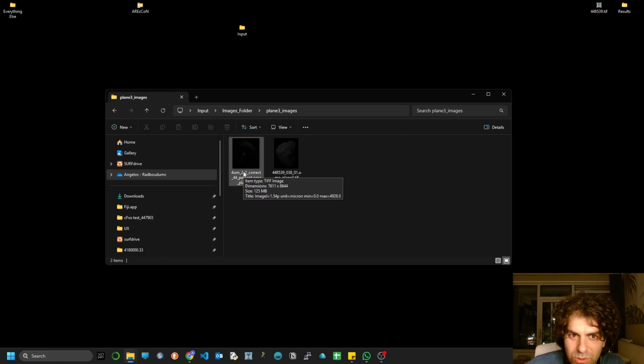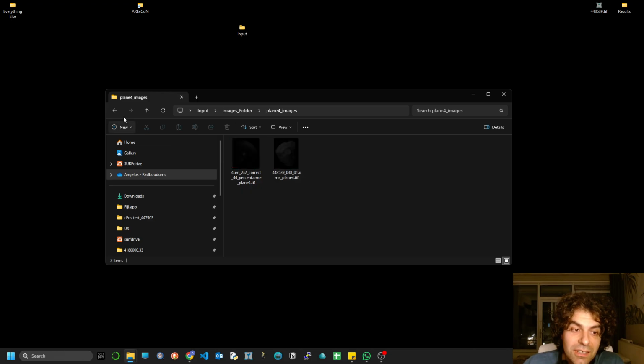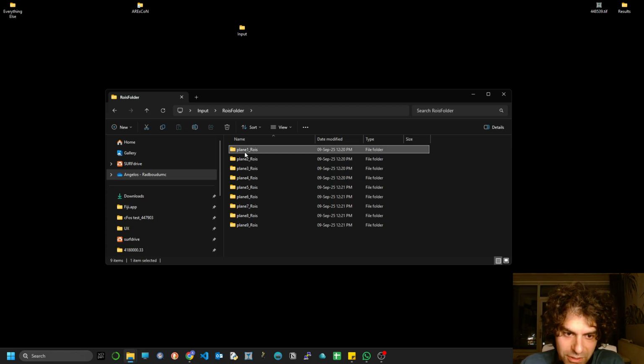I can reduce that to one later, so we don't double the time of this video. But what's happening here is that in practice I have 9 planes, only 2 images. They're multi-stacks, they comprise 9 planes, and that's the way that you should put them across your folders. So you have the images folder and you have the ROIS folder, and the ROIS folder is the folder that includes the primary predictions, the primary inferences that you get by running a neural network like Stardist or Cellpose.